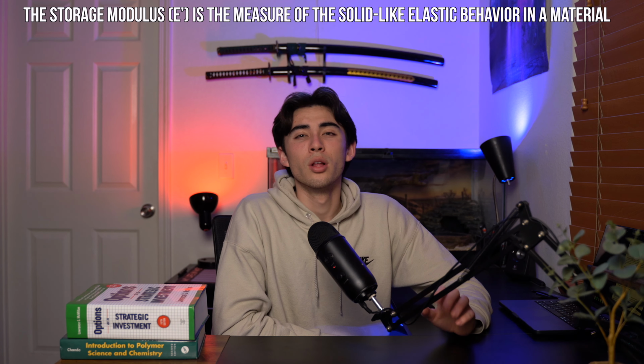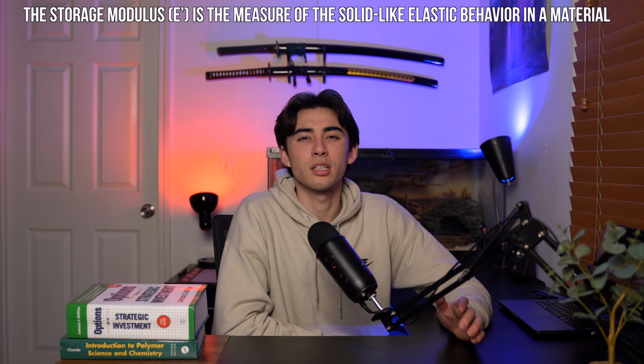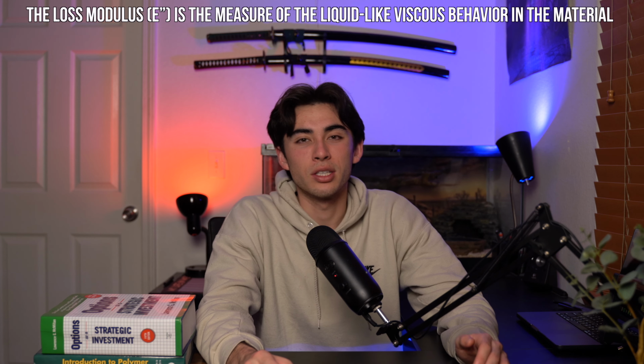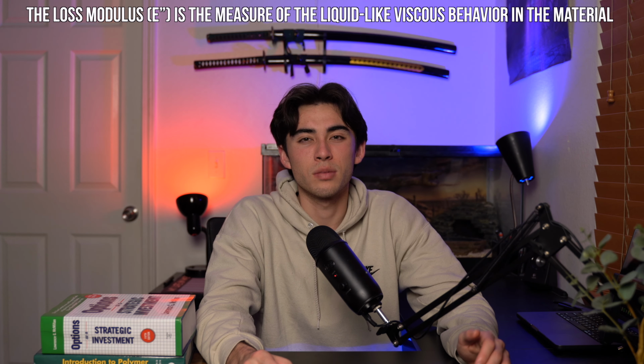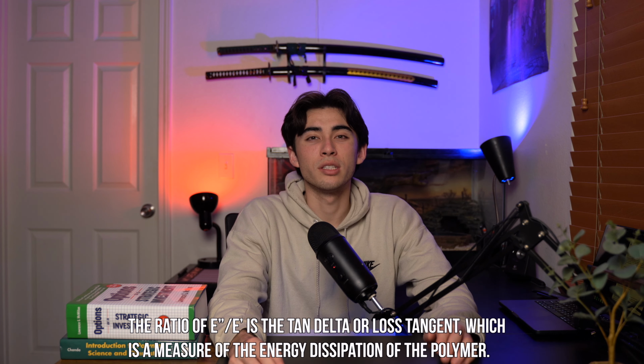DMA measures the modulus as an in-phase component, the storage modulus, and an out-of-phase component, the loss modulus. The storage modulus, or E', is the measure of solid-like elastic behavior in a material. The loss modulus, or E'', is the measure of liquid-like viscous behavior in the material. The ratio of E'' divided by E' is the tan delta, also called the loss tangent, which is a measure of energy dissipation in the polymer.